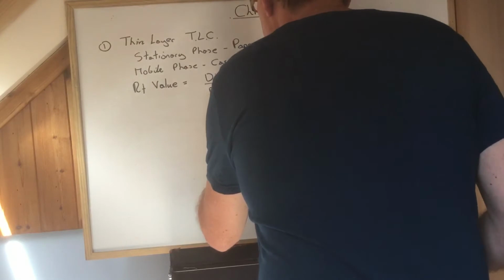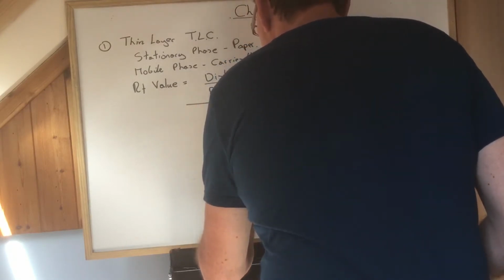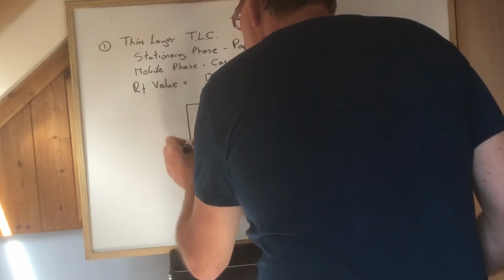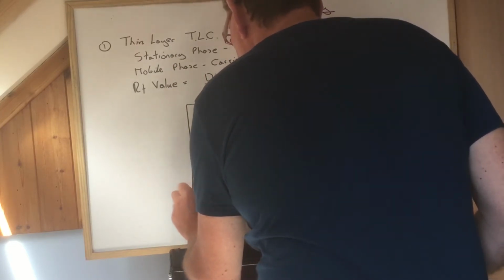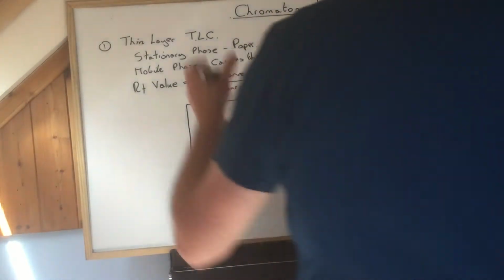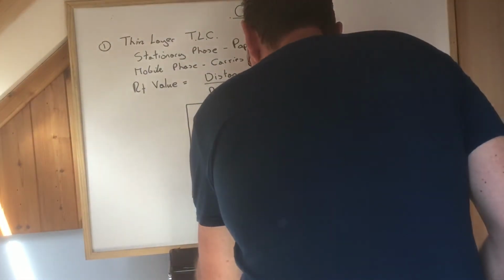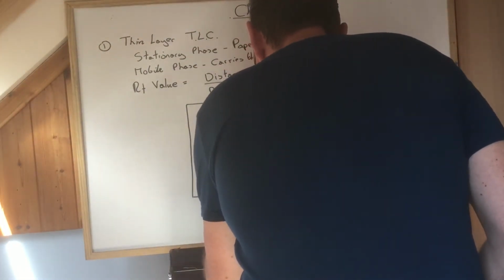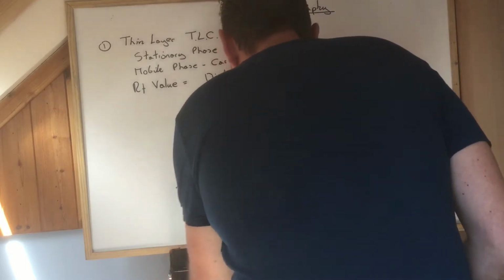So here we are. If you look at the exam questions, you've nothing to fear. There was one in 2019 which was quite good, but have a look if you fancy it. They're straightforward, okay? You take a piece of paper. I'd have done this experiment with you, but obviously, put it in a beaker of a solvent.